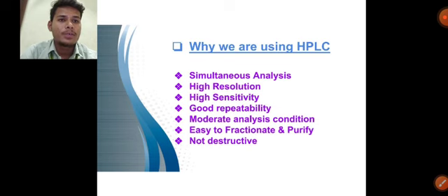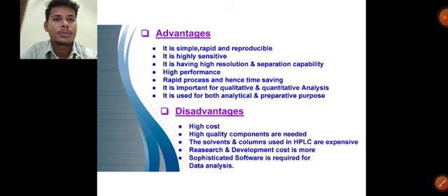Why are we using HPLC? Simultaneous analysis, high resolution, high sensitivity, good repeatability, moderate analysis conditions, easy to fractionate and purify, not destructive.